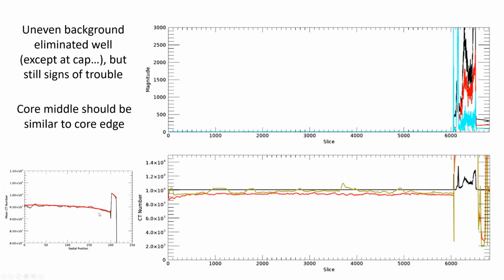We put in a correction to flatten that, but we went past flattening it and overcorrected by just a little bit. But it was impossible to see earlier because of the metal, the iron artifact overprinting absolutely everything.